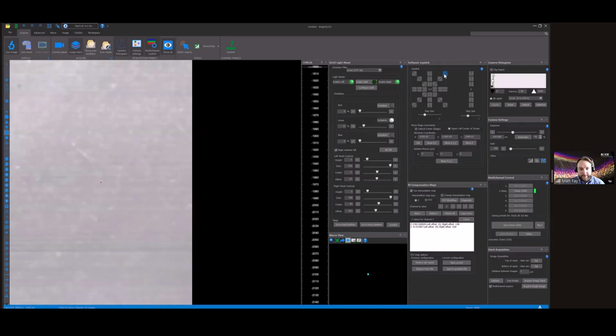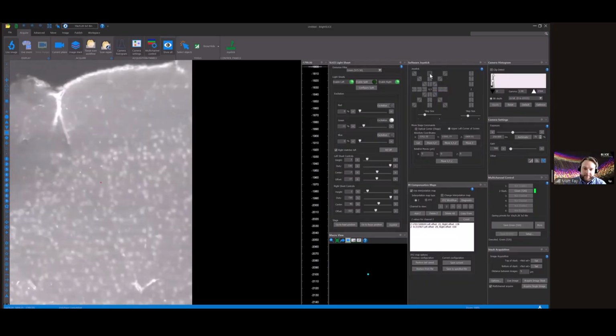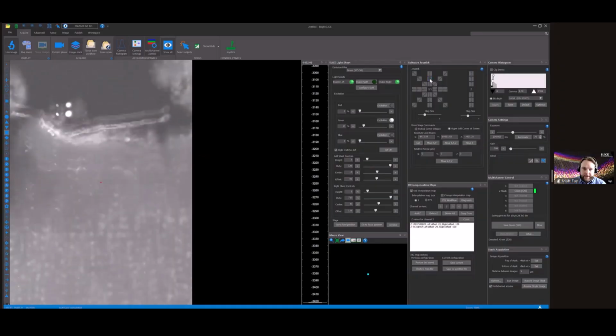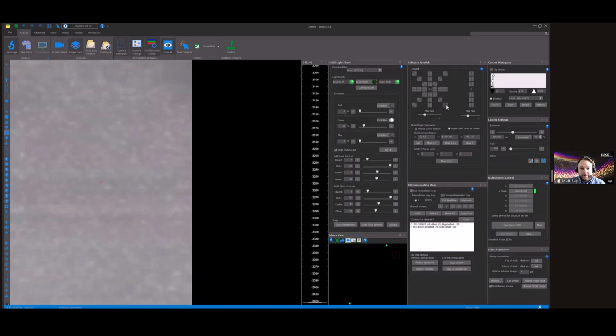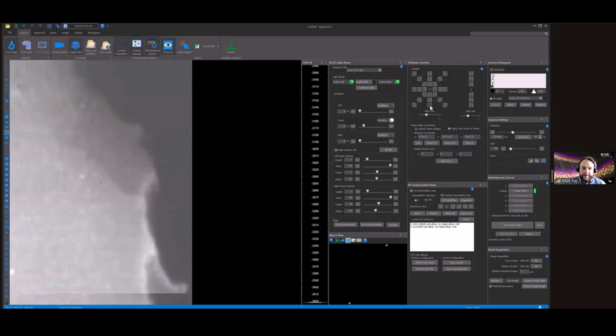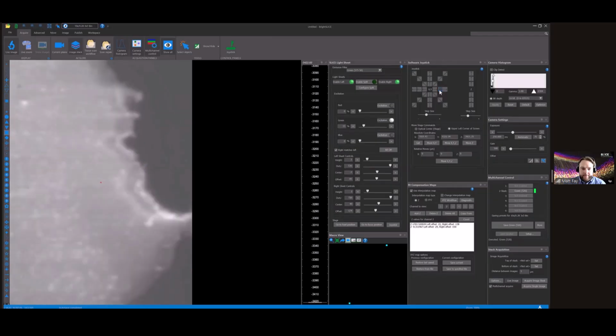I'll then repeat this process for the upper extent of our sample, the right extent of our sample, and the lower extent of our sample in XY. It's important in this process to ensure you're moving through the sample in the Z imaging axis as well, to make sure the tissue does not extend beyond the field of view you're looking at in an imaging plane above and below.